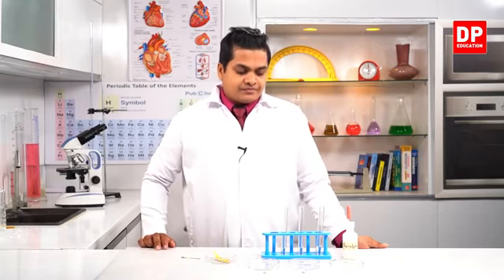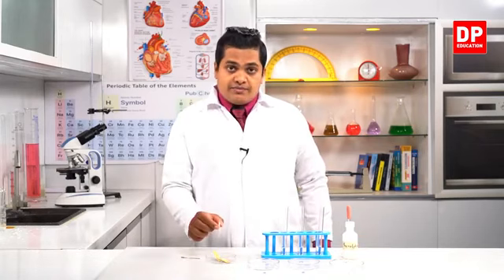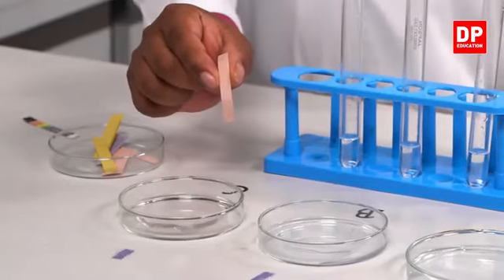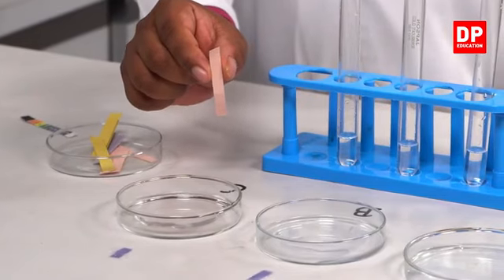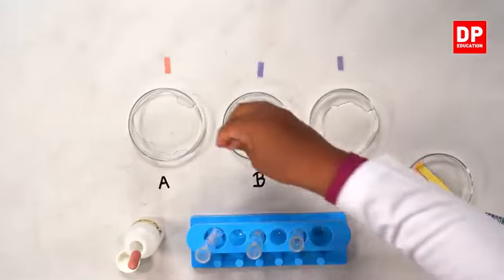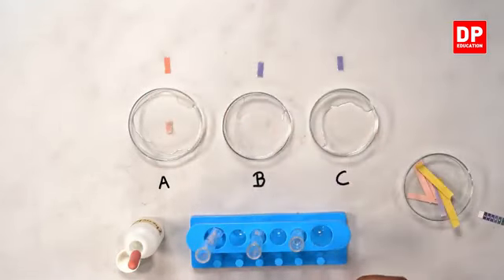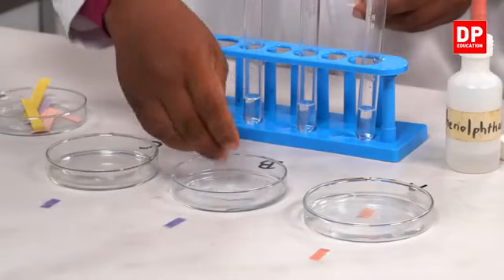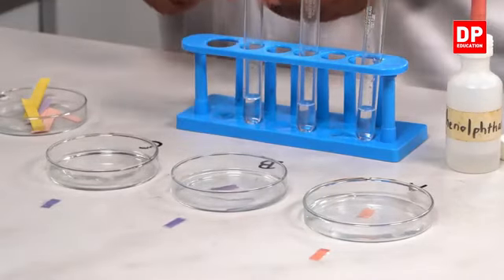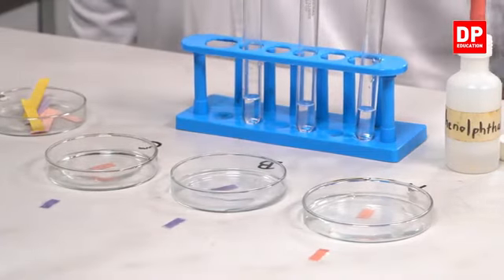Second one, we're going to add red litmus, right? So we'll add a piece of red litmus, a piece of red litmus, a piece of red litmus, and a piece of red litmus. Right then.